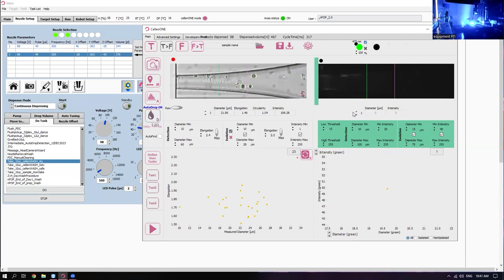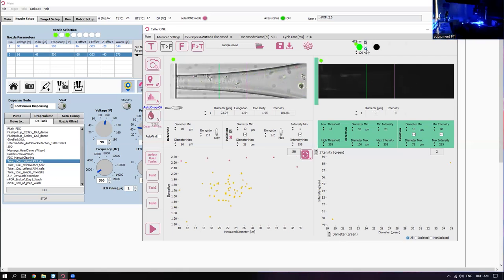Yeah, so is the stain something you want to select for or against? Essentially, if you want to select for it, you'll set this check mark here, and you'll make sure that these parameters give you, in this isolation mode, a cell that you're interested in that has a large enough fluorescence signal. For this one, we would say that we don't want to select cells that have this green color. And so that is that.